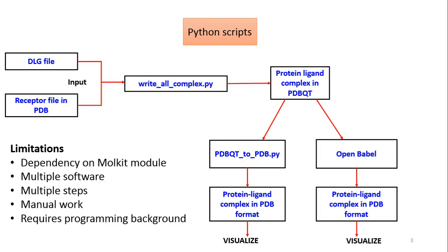These are some of the workflows or protocols that people generally use for post processing the docking results, right? So all of the software that I have mentioned in these three workflows or protocols needs to be downloaded and installed separately.